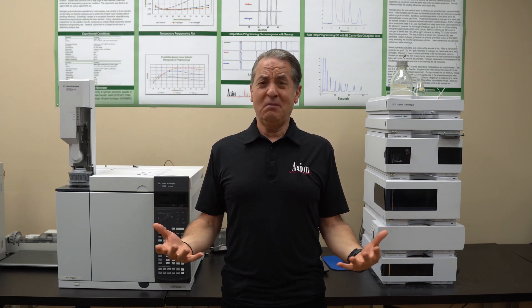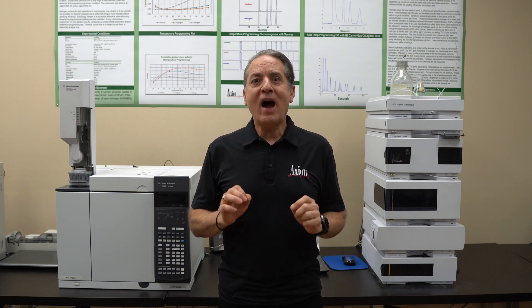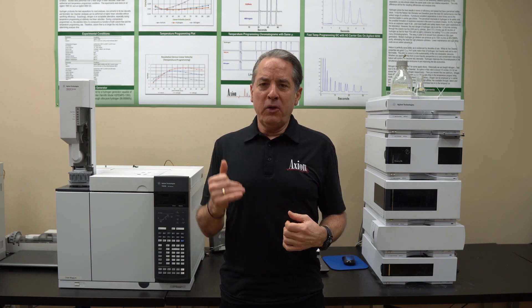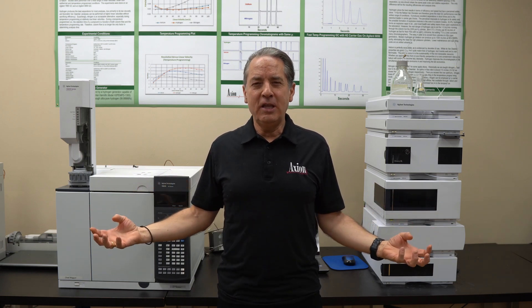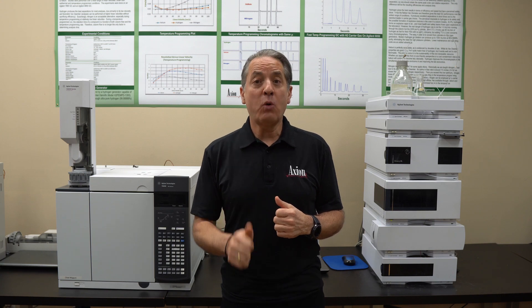GCs are pretty easy going. There's not a lot of special things we need for them, but we do need high purity gases. High purity is a relative term, but think about a GC — we're measuring parts per million, parts per billion, parts per trillion of impurities. So any little impurities in the helium are really going to mess up our analysis. So make sure you're buying high quality helium.